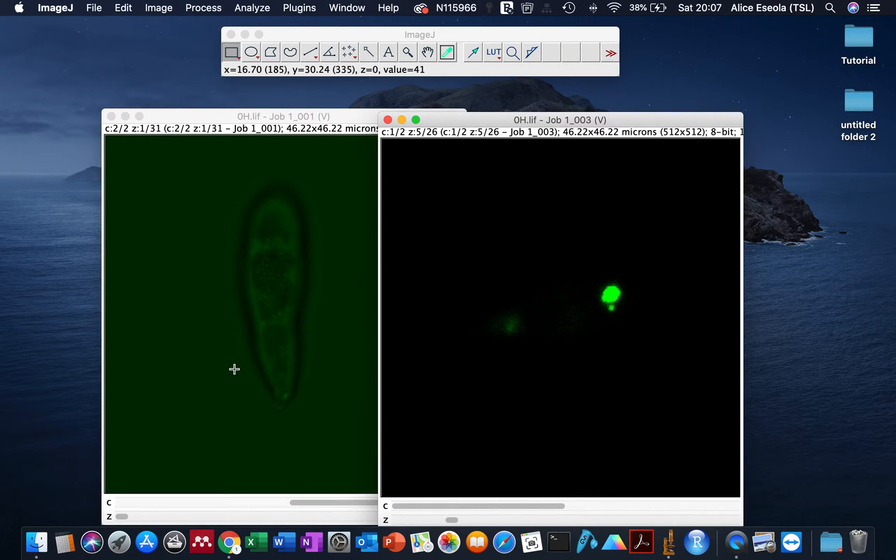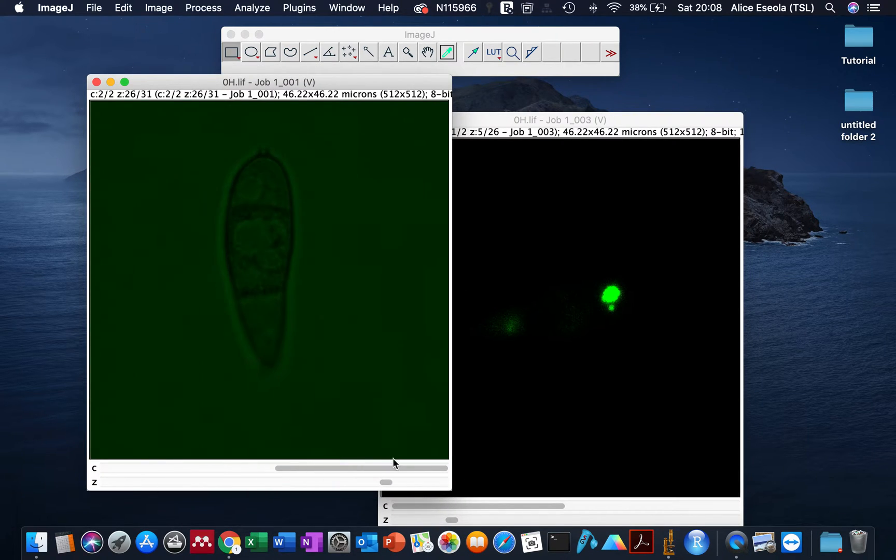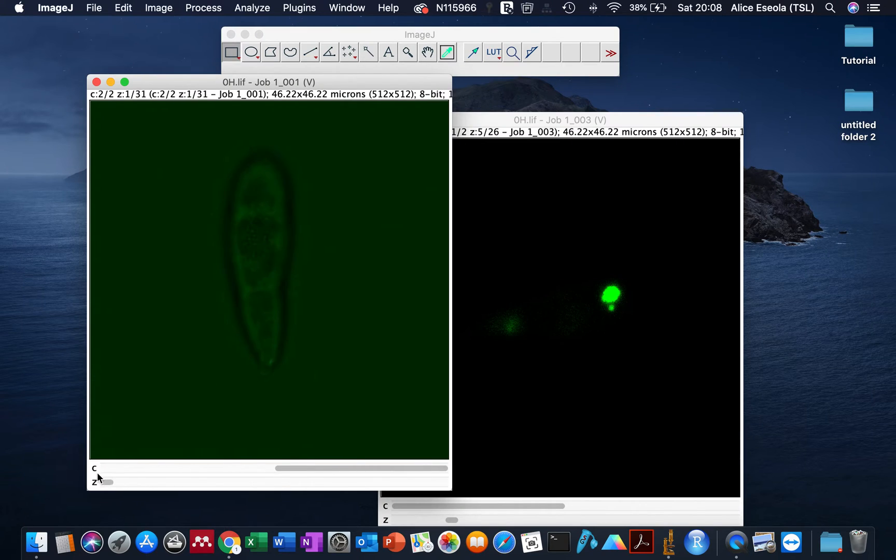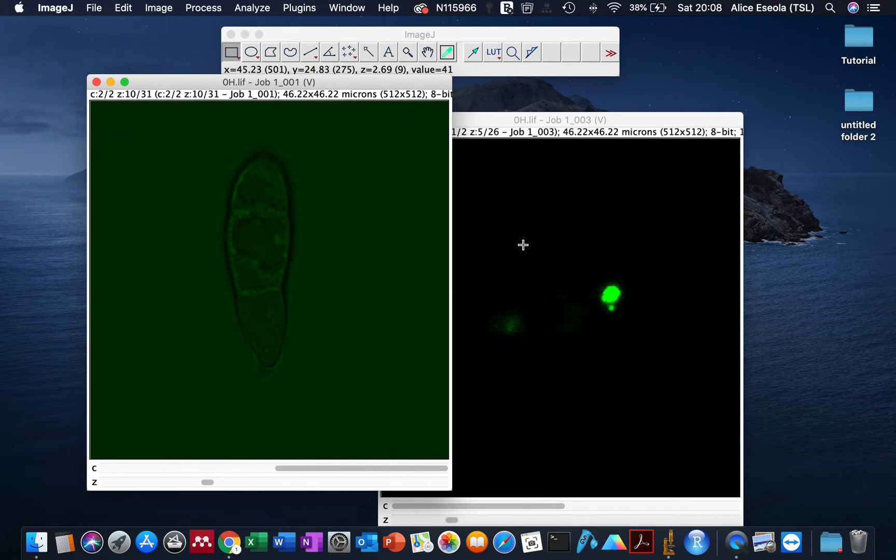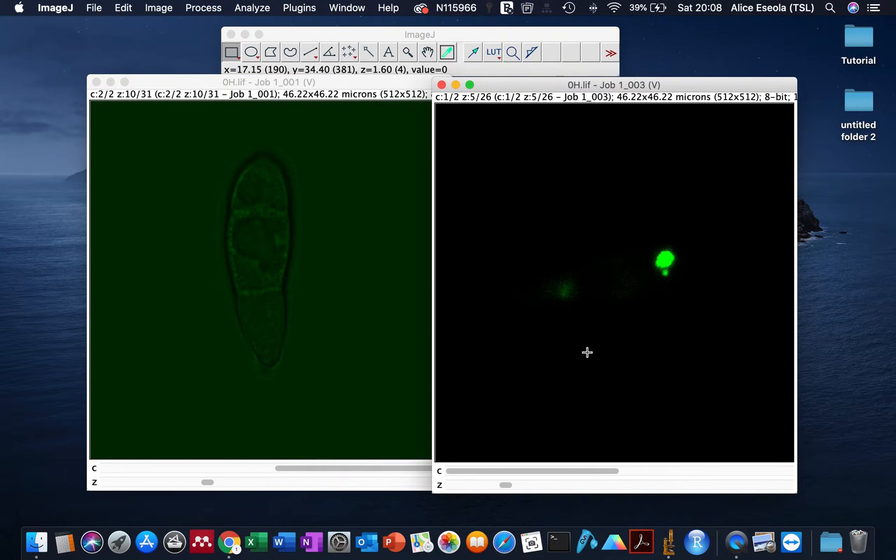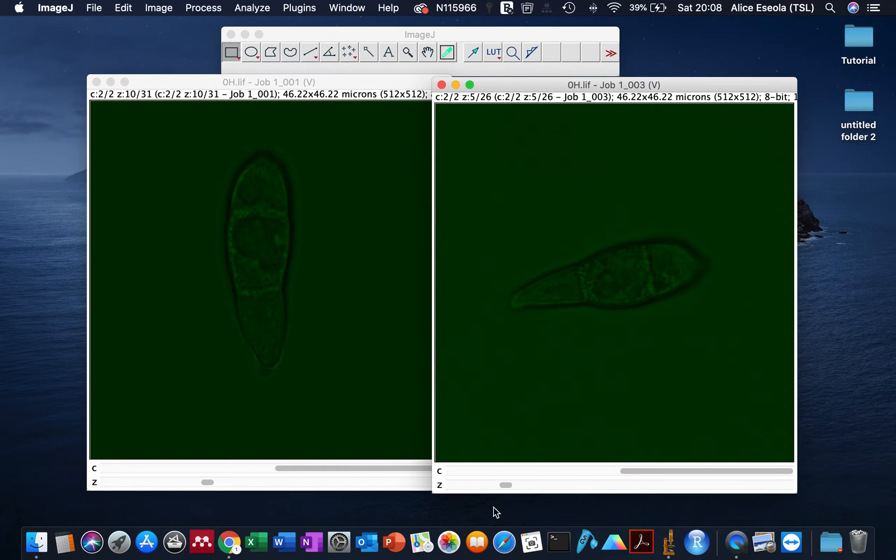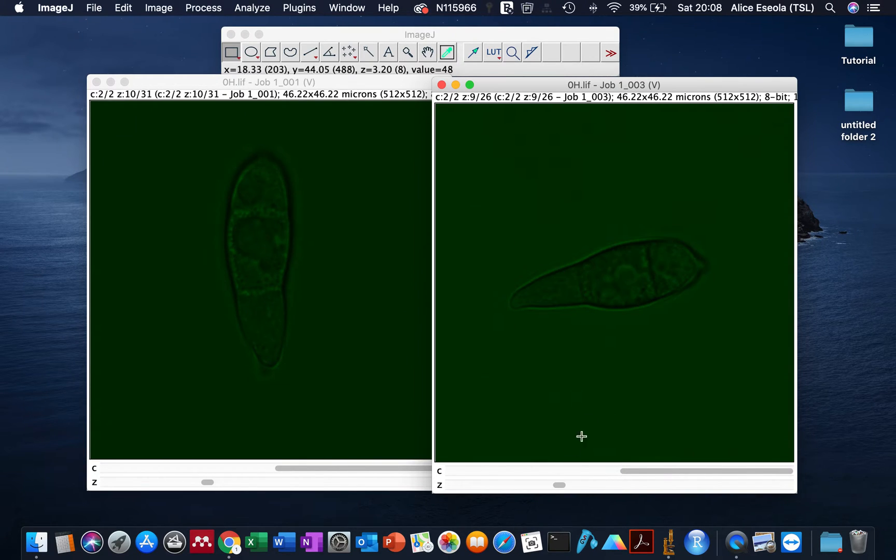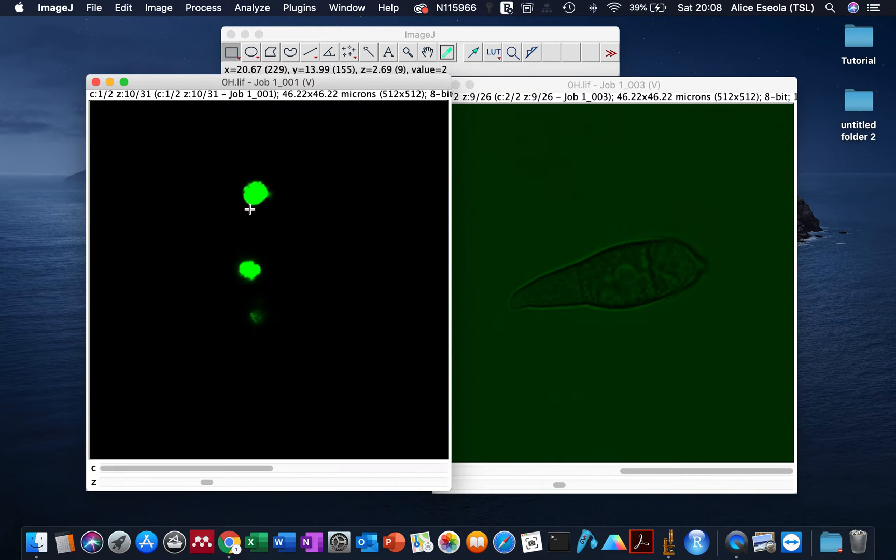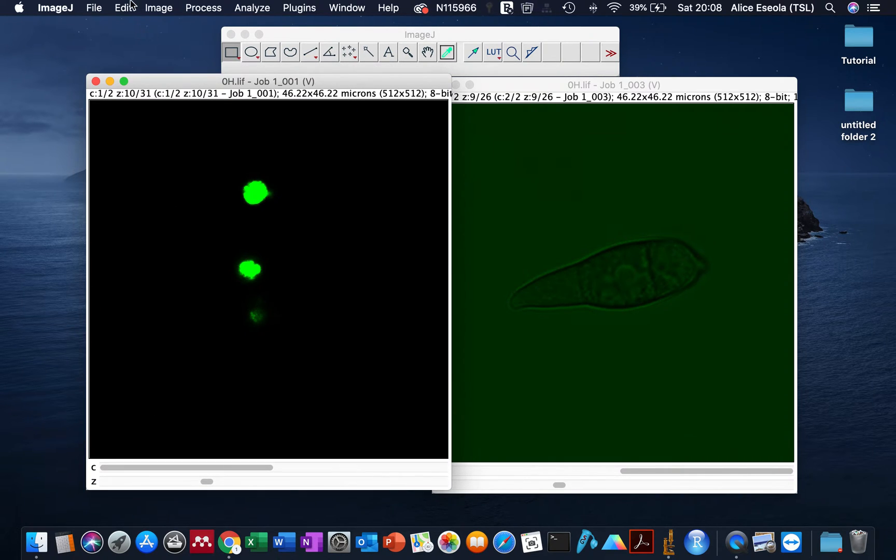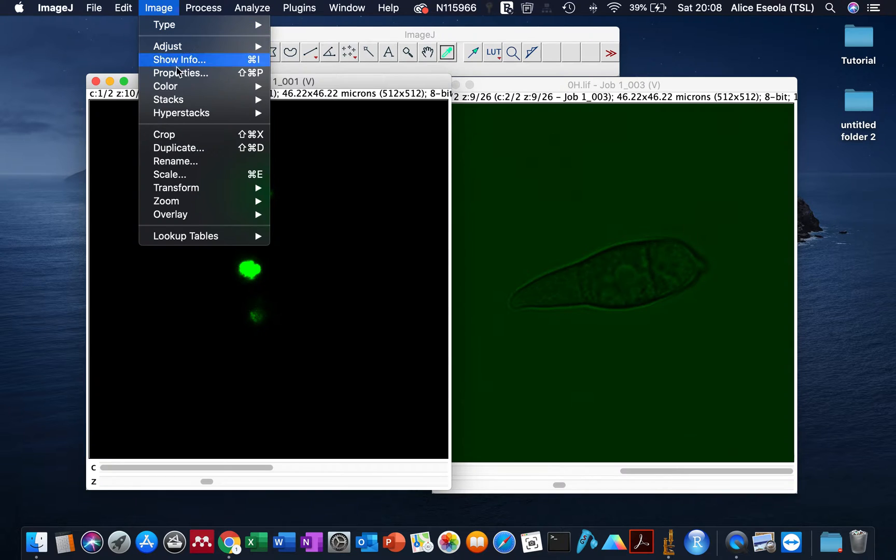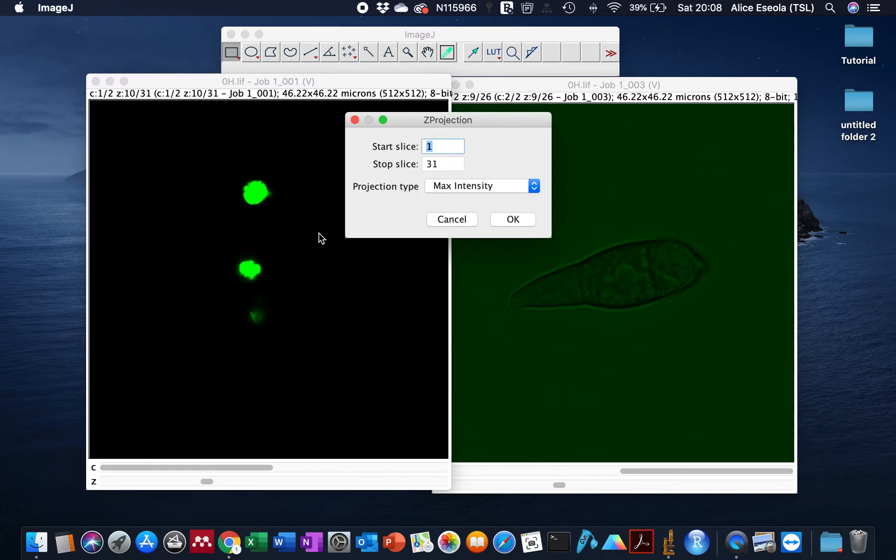The sample I'm working with is conidia of Magnaporthe oryzae, a rice blast fungus. The green signal here is from the nucleus which is present as a single nucleus within each cell compartment. For us to work with these z-stack images, we'll make a maximum projection. To do this we go to Stacks, Z Project.